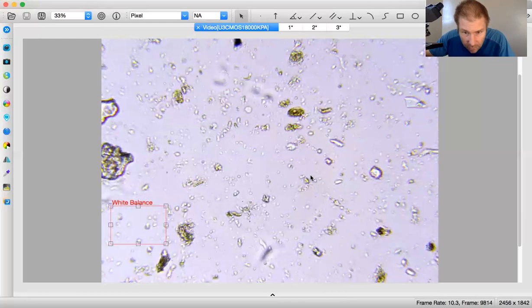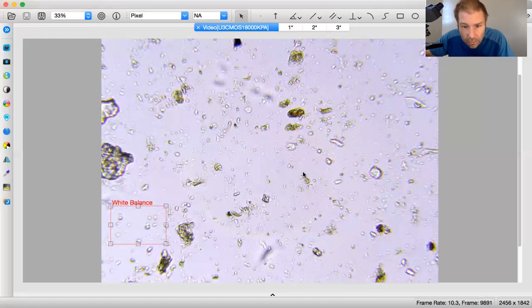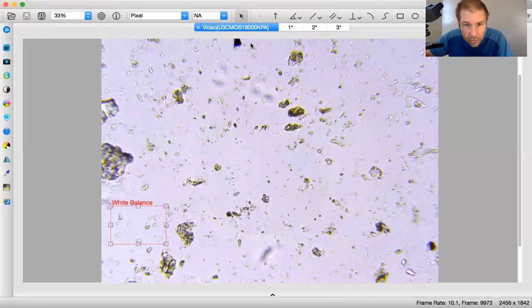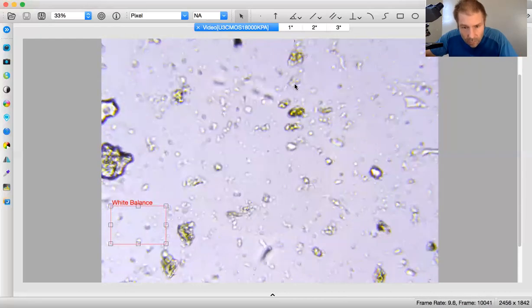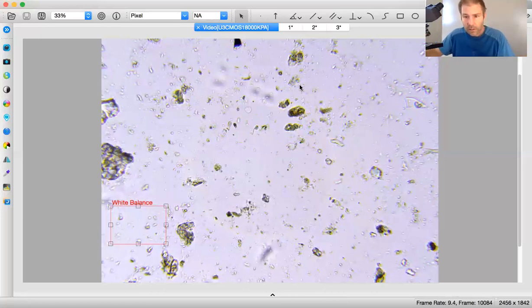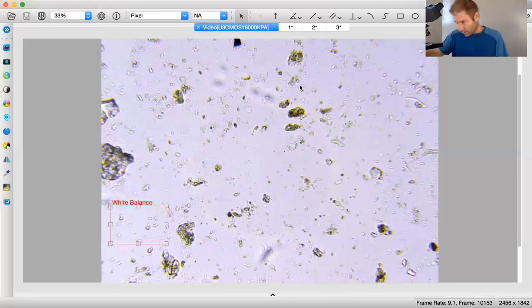That actually does look like actino. It's not bacillus because it's not straight. So that is a small piece of actino. And I want to say right here is another small piece. That one hasn't moved at all. So I think together, those are going to be another 0.1. Yep, together. So that would be 0.1 actino. Okay, and that was field of view 3, reading area 1.